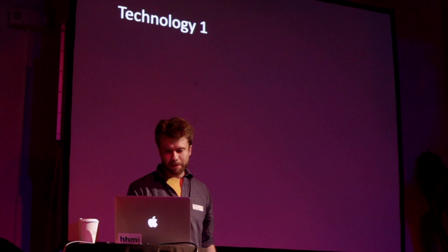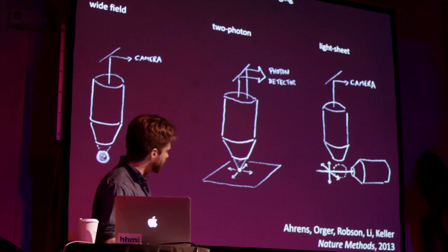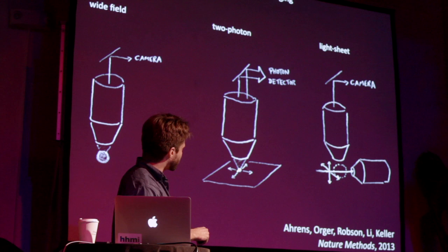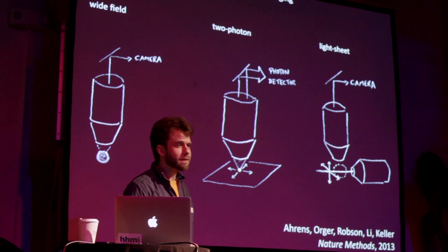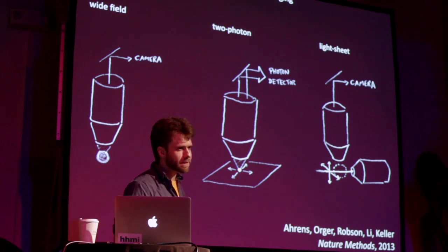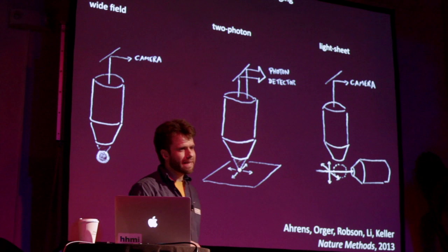We use a slightly different imaging technology. Instead of light field microscopy, we use light sheet microscopy. This is how it works. So just to compare to another microscope that's very common that Nick talked about as well, which is a two-photon microscope. This images a volume, so it can register neural activity in a volume by scanning around a single point of excitation. So this is a great technique, but it's slow for three-dimensional volumes because you have to scan one point in 3 dimensions. With light sheet microscopy, instead of using a point, you use a laser beam, basically.